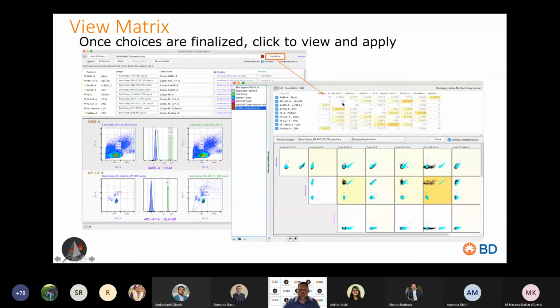I would expect mostly positive numbers, and fundamentally values over 100 are acceptable, especially on some instruments. You can't get away from it, but if you're doing any type of low or mid-level parameter experiment, then you can probably set your voltages so that each comp is brightest in its own channel and all the spillover values will be less than 100. But fundamentally, there's nothing incorrect about having spillovers greater than 100%. It just can be avoided with better instrument setup. I'm sure that you guys can talk to the tech support team at BD and come up with a solution there.